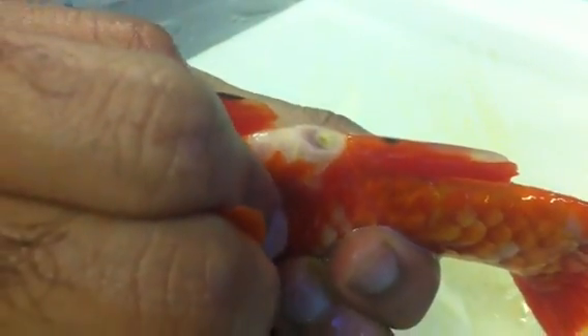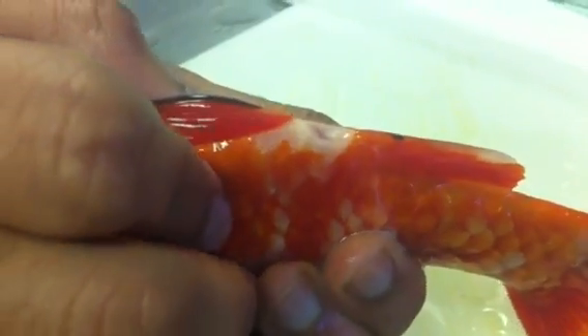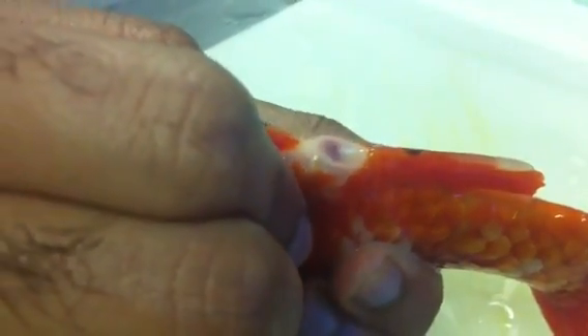This is milking a fish, so you need to go gently. You can see the white bit is the milt, which is the sperm. This is from a male goldfish during springtime.